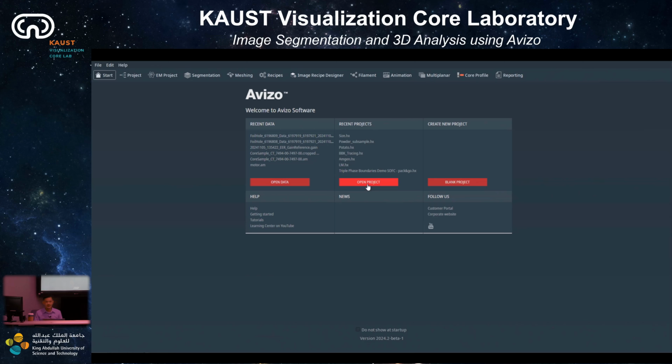And good news, because I got some questions about what people who already work on PerGeos projects are going to do with the new Avizo features: you can open all the PerGeos projects in the new Avizo, so no problem. Even if you already created a lot of projects or files that you are working with in PerGeos, this will be supported in Avizo. So, no problem at all.